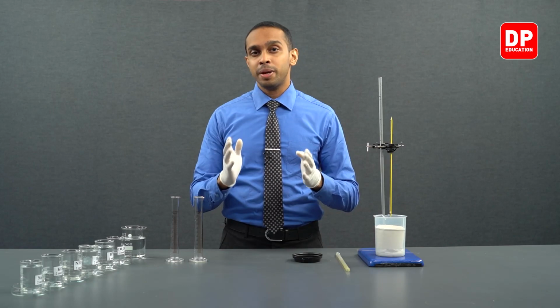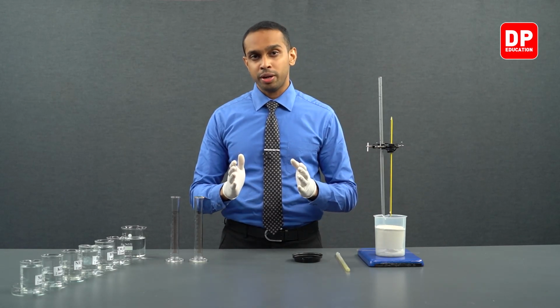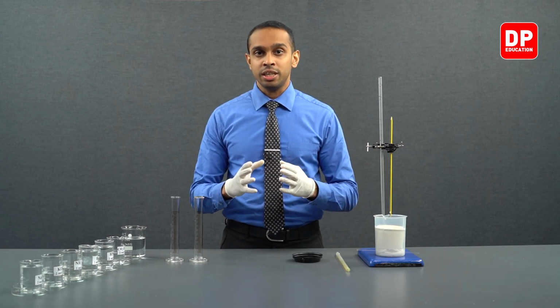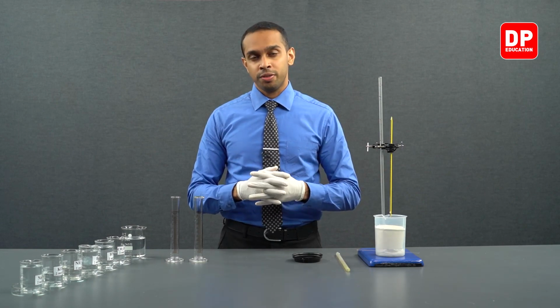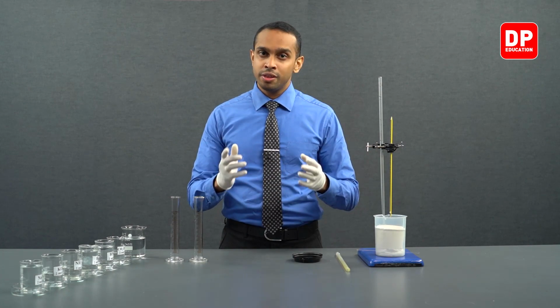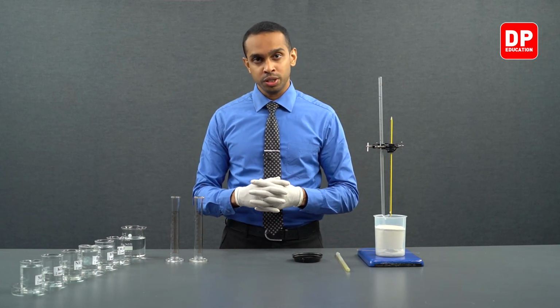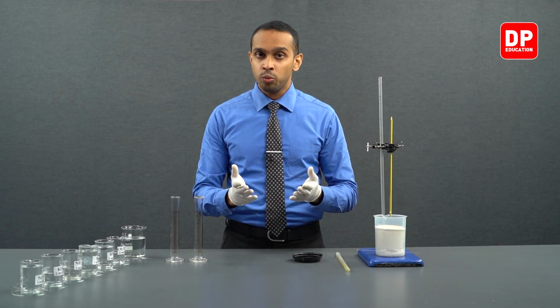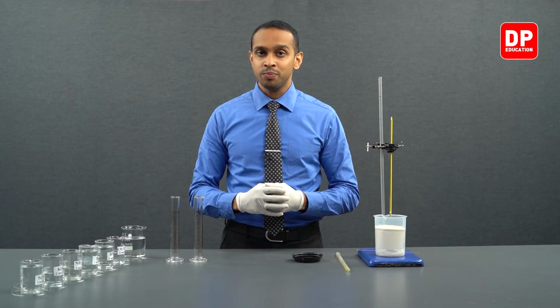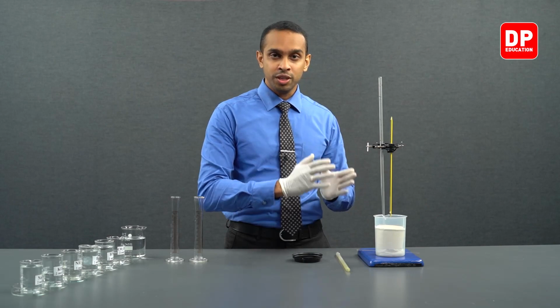Normally, an acid-base reaction is an exothermic reaction. Exothermic reaction means as the reaction proceeds, energy will be given out of the reaction. Energy will be released from the reaction. This energy will be taken up by the water in the solution, and the temperature of the water will increase. When we are conducting this experiment, we are going to measure the temperature increase of this reaction.